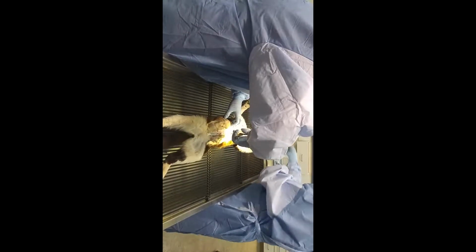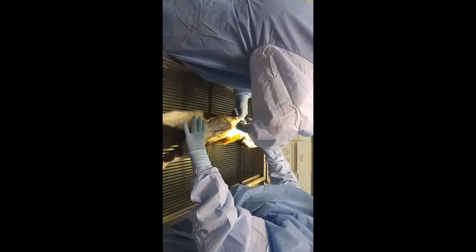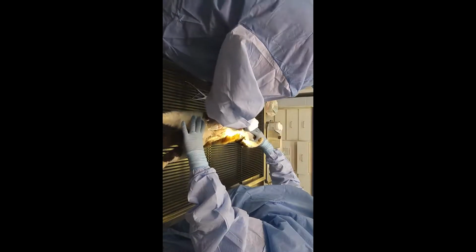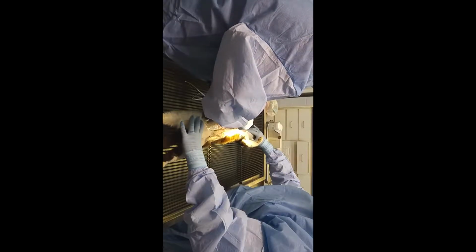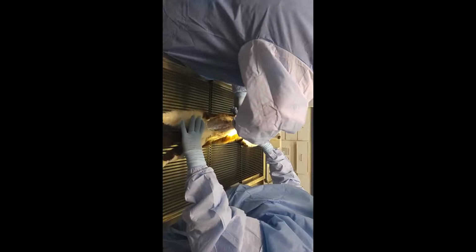I'm going to use these to just kind of cut through the ribs. Some of that muscle. I'm just going to kind of cut right along the sternum. It's a little easier to get through them.